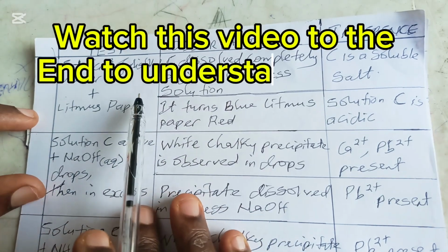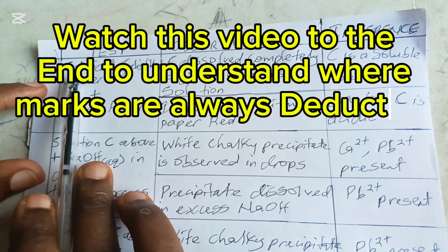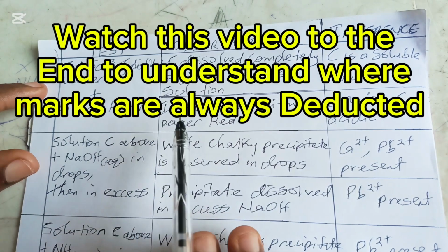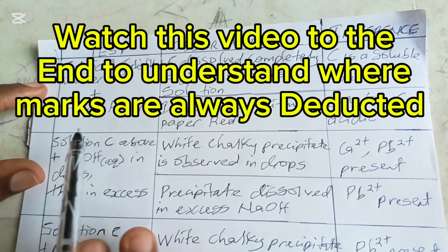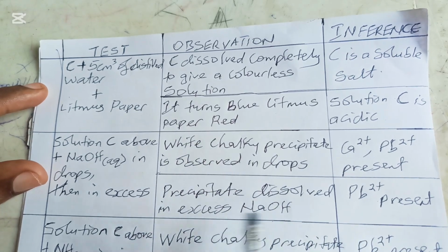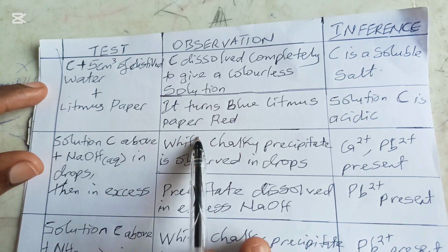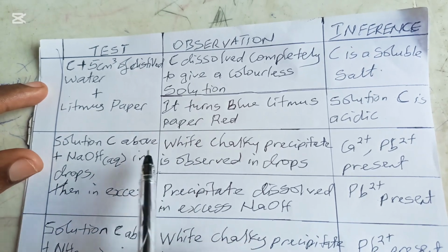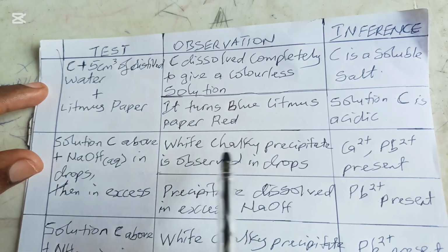Now, let's start. You'll be given a salt C and you'll be given a salt D. So let's talk about salt C first. I will advise you to watch this video to the end because I'll be giving you some warnings. Little mistakes can make you get 0, even if you write the correct answer here. There's a lot of deduction in practical chemistry. So I'll be telling you the deductions as we go on, and at the end I will tell you a lot of rules that will help you.